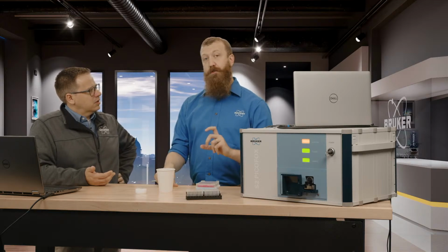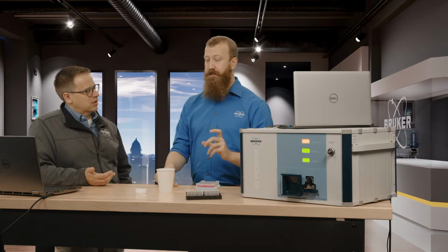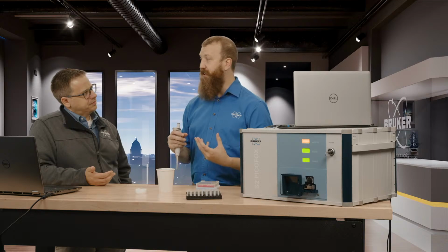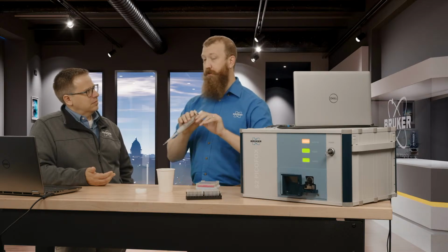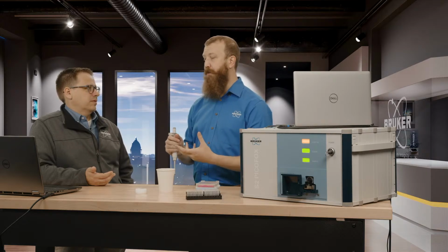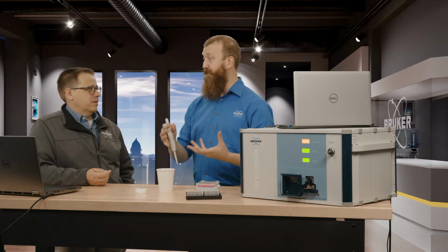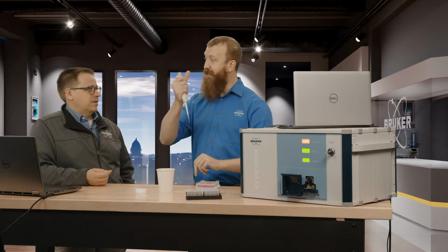Okay. So if you have, say, a geological sample and you want to screen for heavy metals, the silica in the geosample is actually something you don't want on your film, because all of those silica crystals will increase your scattering. So you can take your geosample, place it with a little bit of nitric acid to make all of the metal ions mobile in solution, centrifuge all your powder to the bottom, and then take the liquid off the top.